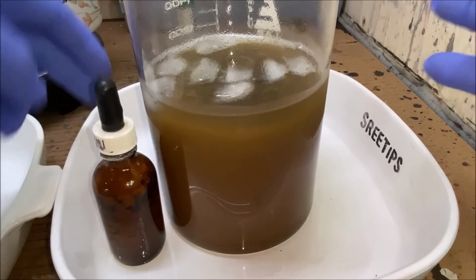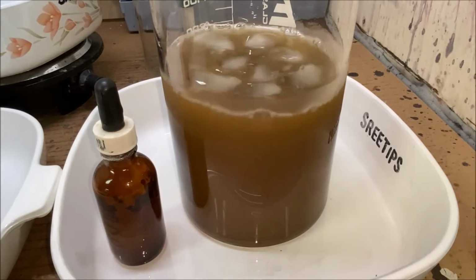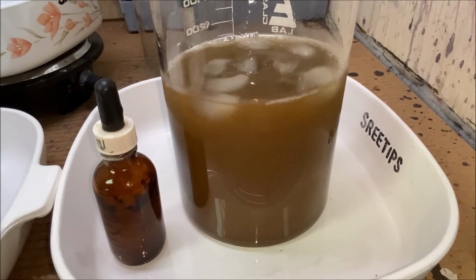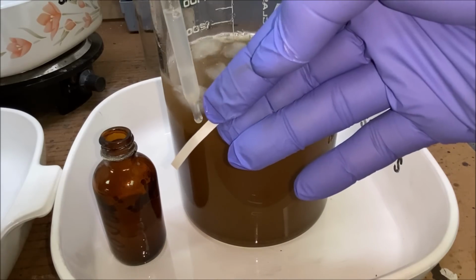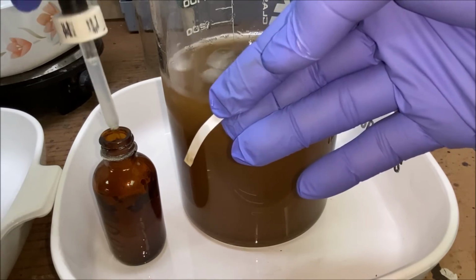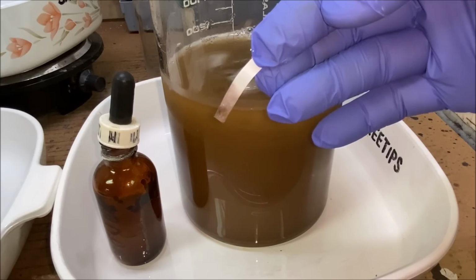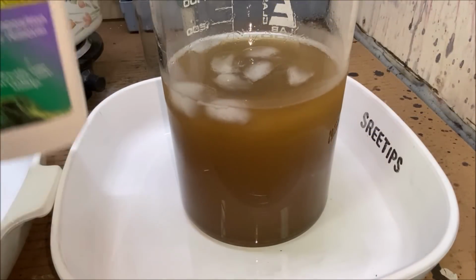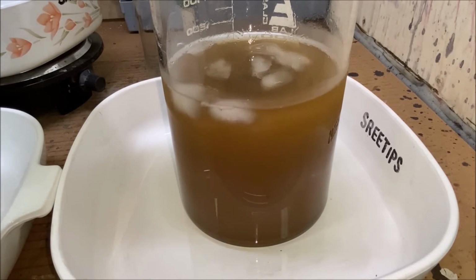Looks like all the gold has been precipitated with just 2 spoons of SMB. Let's get a little on our filter paper here. No, we still got a little gold in solution. I'm adding another spoon of the SMB. Here we go.